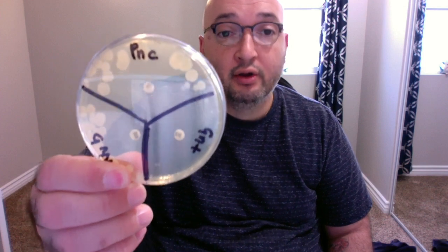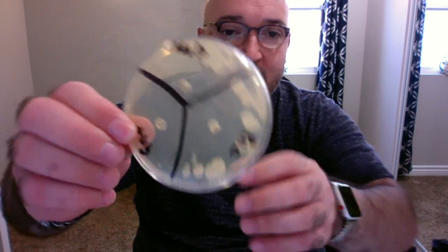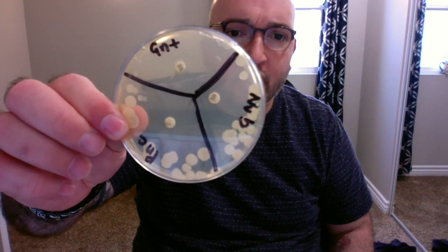So now I'm going to show you my results, and unfortunately, these results are not what I was expecting to see. So here is my agar plate petri dish 24 hours after incubation. Again, the PNC is penicillin, the NVB is novobiocin, and the GNT is gentamicin.